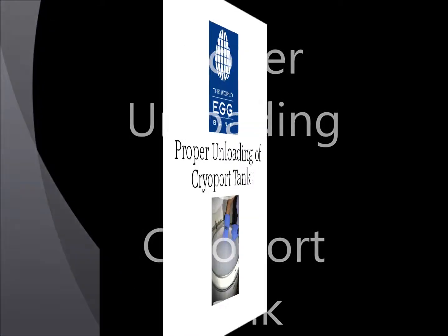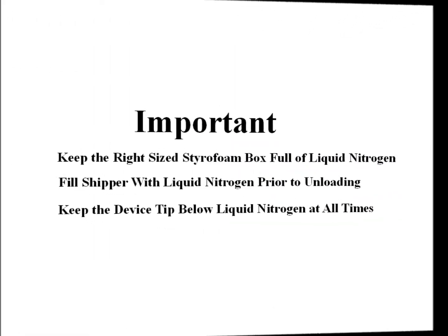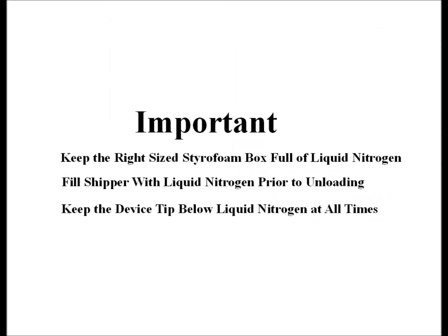This video is an instructional on how to safely unpack vitrified ova from the cryoport shipper and place them into your inventory. The keys to doing this without damaging the vitrified ova are: first, use the correct size styrofoam box for transferring ova to your storage device — this box must be large enough so that the device is never lifted into the air. Second, fill the shipper with liquid nitrogen prior to removal of the canister. Third, always keep the device that contains the ova under liquid nitrogen. Do not transfer the device even briefly through air, as the temperature only has to warm to around minus 110 degrees for damaging recrystallization to occur.